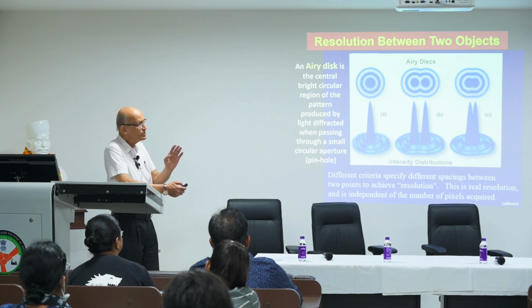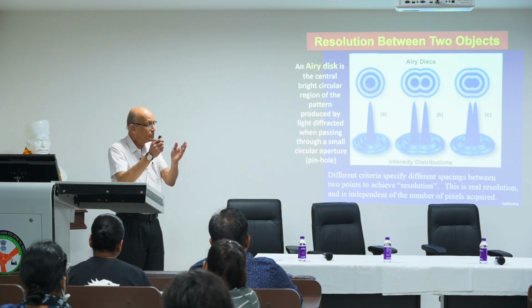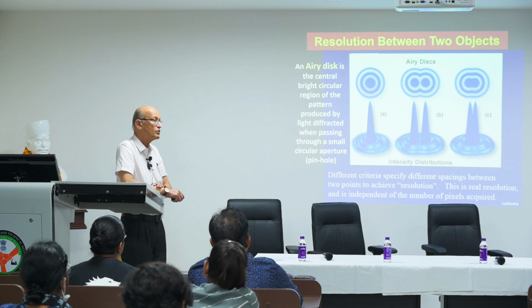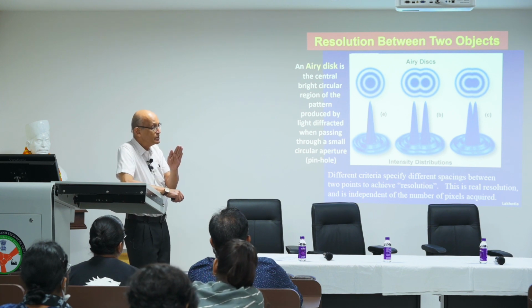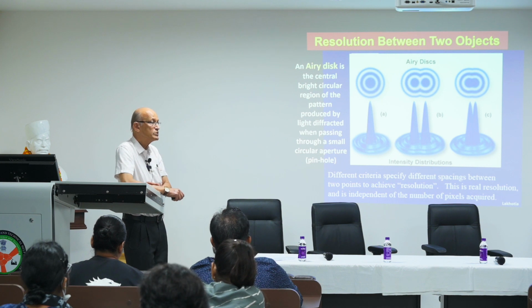Ideal is 1 Airy unit, but if your fluorescence is very weak, you can compromise either by increasing laser power, or increasing the digital gain, or by increasing the pinhole a little more. But the moment you open the pinhole more than that, you are losing some spatial resolution.